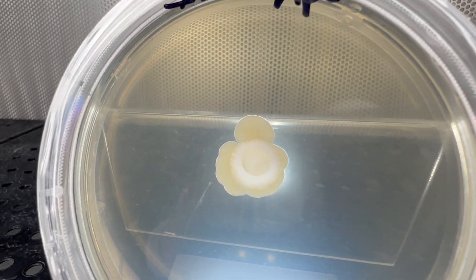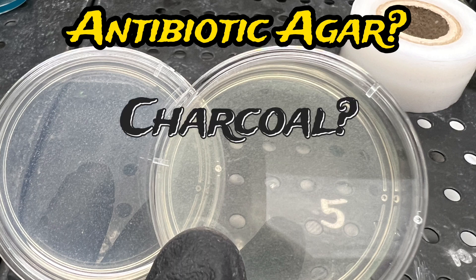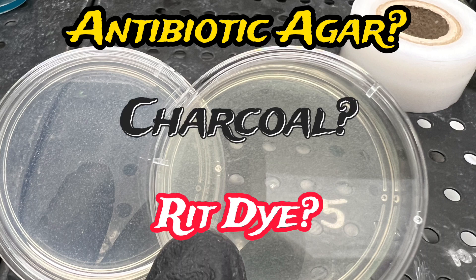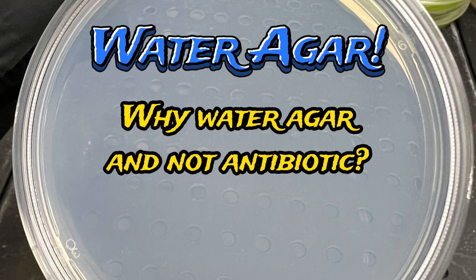Cleaning up contamination — what do we do? Do we use antibiotic agar? Charcoal? Rit dye? No, we'll go into water agar because I believe that's all you need.